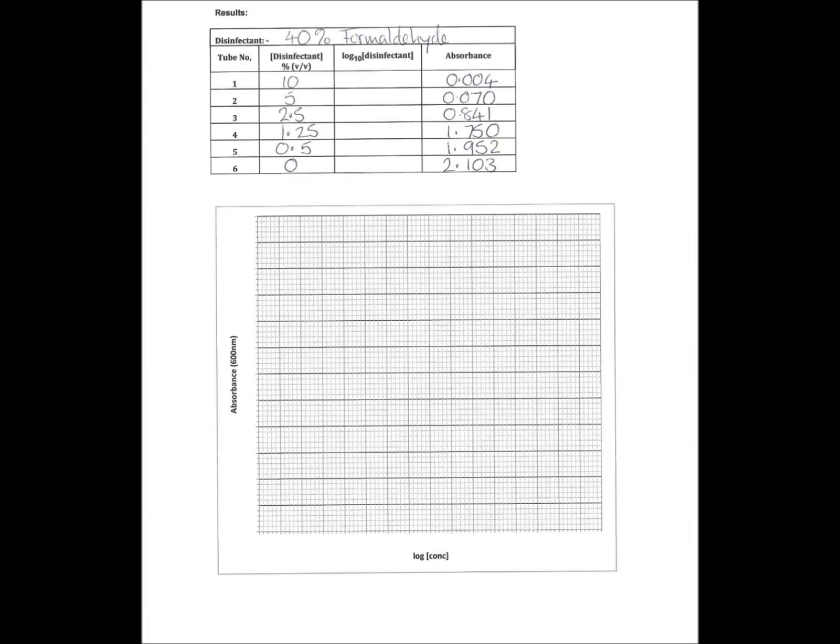So what I have here is the data from my 40% formaldehyde experiment. I've got the concentrations here in percentage disinfectant, which I've just copied across from the table where I worked these out. Then I've got my absorbance readings here, but you'll see that there's an empty column labeled log 10 disinfectant, and I need these values.